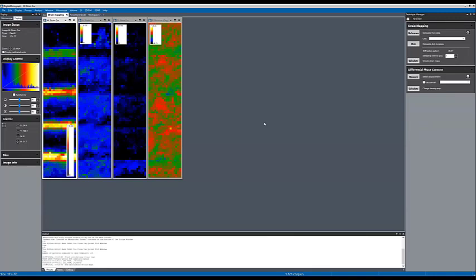And also, if you remember, at the very beginning of my presentation, I showed two different diffraction patterns. One from a thin area, the other one has more features within the disc. So as Anna mentioned, there is a sweet spot where you have better accuracy in the strain mapping. With a very thin sample, we might face some issues because of bending. So it has some sort of minimum thickness, and it depends on the sample too, right? Yeah.